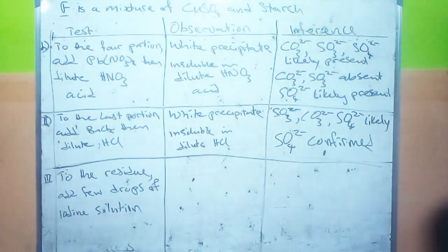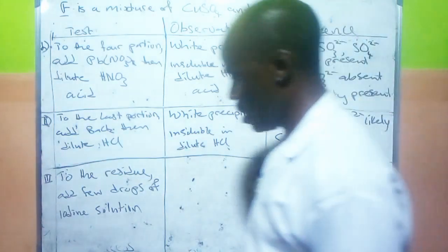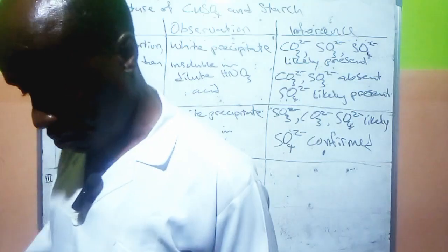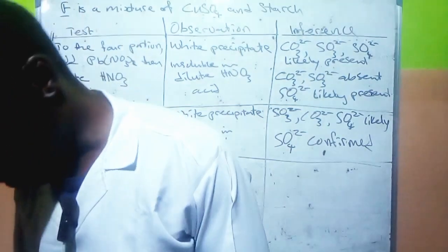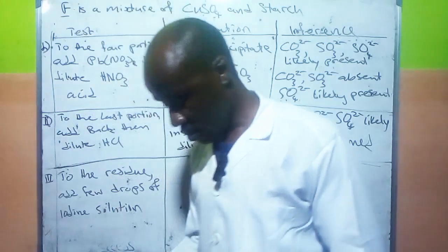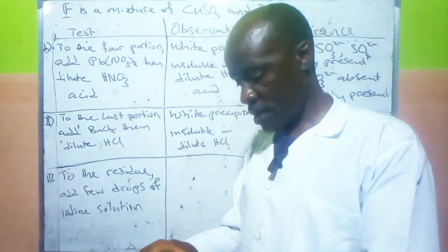So now the last one says, to the residue, add few drops of iodine solution. To the residue, I'm going to add few drops of iodine solution. So I have my drops of iodine. So let me put it here.